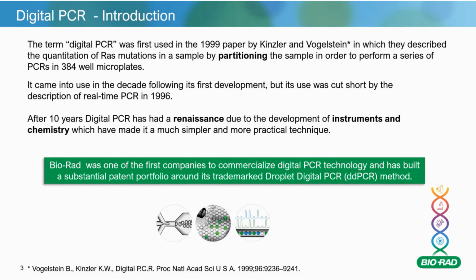So some of you may be interested to know that the term digital PCR was almost described at the exact same time as the release of real-time PCR. It was almost slightly before in some aspects, because the methodology made a lot more sense than real-time PCR, because we were already using endpoint PCR. So it made sense to keep the detection method at the end, because no one wants to read the detection method in the middle.